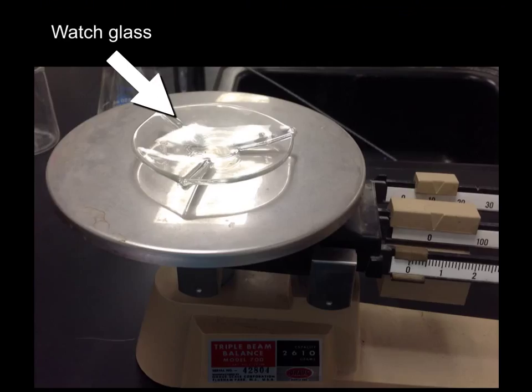The next piece of glassware we're going to look at is called a watch glass, and really it's just kind of a multi-purpose dish. For example, you could put it on a triple beam balance and use it to hold the chemical that you're finding the mass of because you never want to put the chemical directly on the balance.